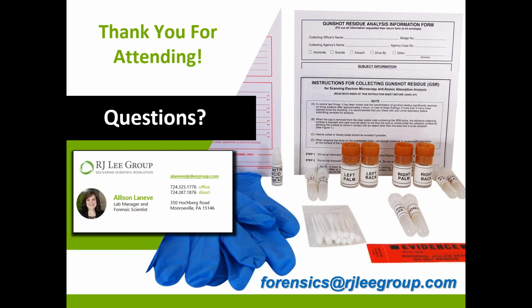If clothing is not an option, then something that you can do in a pinch, I would recommend even a roll, like a tiny donut of Scotch tape, even over a swab. You probably have a better chance of getting particulate from that Scotch tape instead of the swab. But clothing first, Scotch tape last, and if it's possible for us to get you a kit instead of having to use that Scotch tape, then that is also something I would recommend.